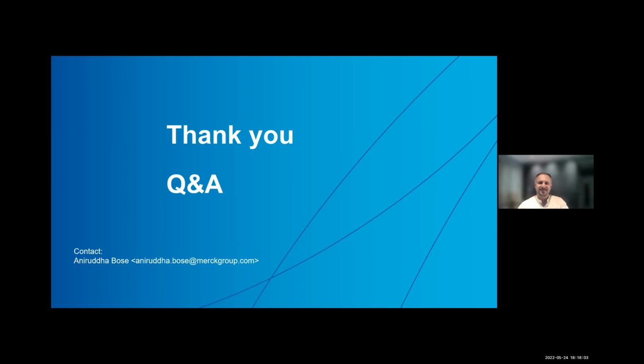Yeah, thanks, Anirudh. Sometimes if you're talking about bioprocessing, there are times where data is required from your lab instruments. If there's a cell counter which is just present in the manufacturing area, there would be a quick typing in of a result into the system. So will the Bio4C platform allow manual data entries or even data to be picked up from lab instruments? Is that the connectivity you're enforcing as well? Ultimately, all this data would go in to predict the yield or to derive some insight out of that information, right? So is Bio4C open to all these connectivities as well?